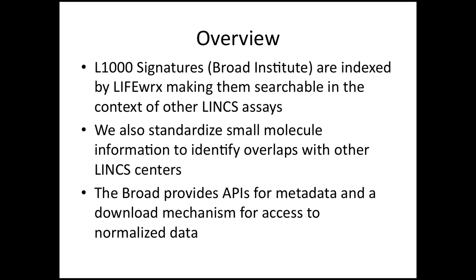We index the L1000 signatures which are categorized as gold by Broad, and we make them searchable in the context of other assays. In the process we collect small molecule information, cell line information, shRNA and cDNA, all the information that is generated across LINCS centers.